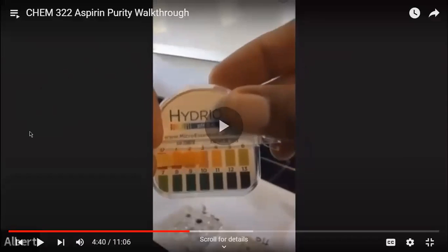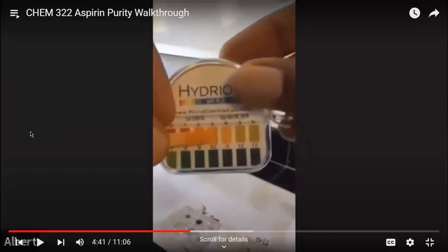All right, so I can save us a few seconds here because all of the samples had the same pH. Whether you have sample 1, 2, or 3, the pH is going to be 4. So you can fill that part into the data sheet. None of the samples deviated from that.